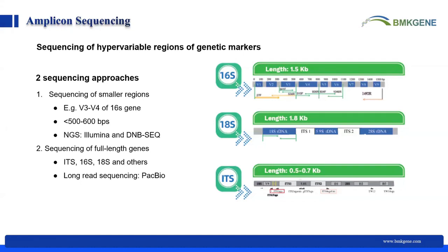But in the last few years, the cost for long read sequencing has really gone down. So this means that we can now use PacBio to sequence the full length of these marker genes. And this really improves the outcome of the research projects.